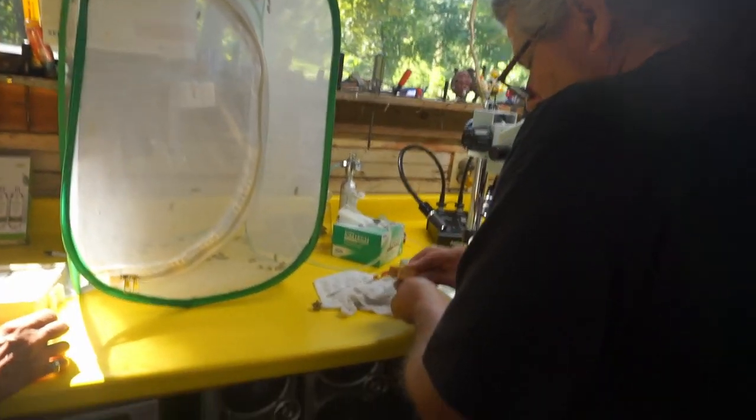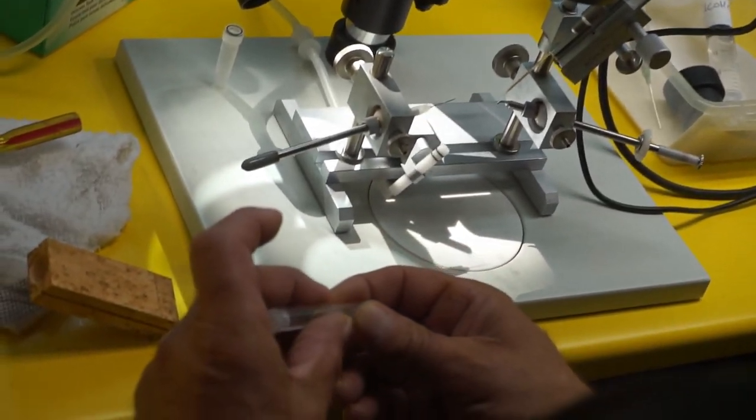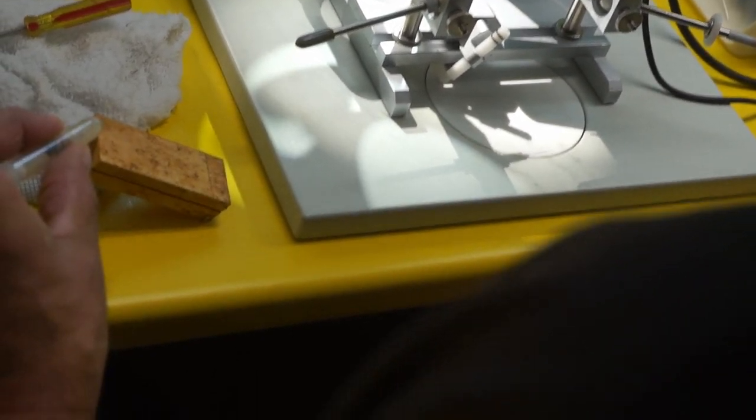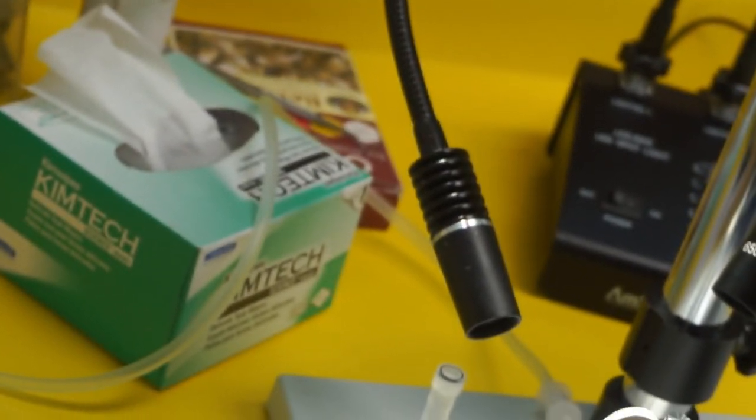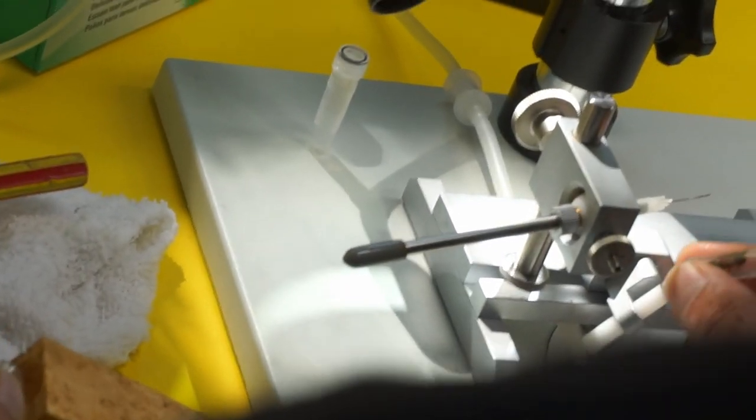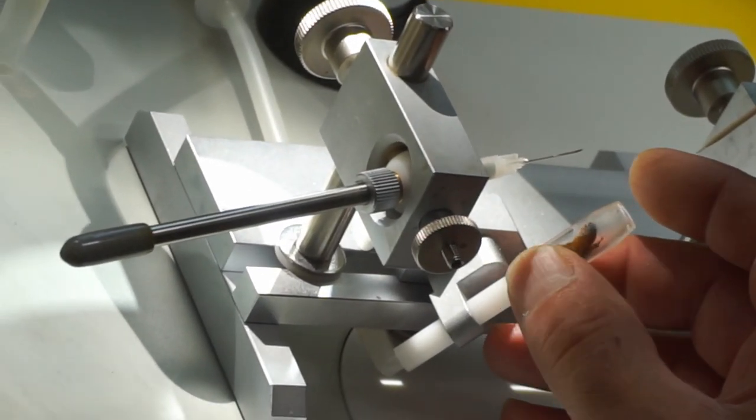So these queens came from the breed of queen. So she goes in the tube and then she'll reverse back into this. So she'll back in there? Yeah, she's supposed to back in there. She didn't read the directions. Perfect.